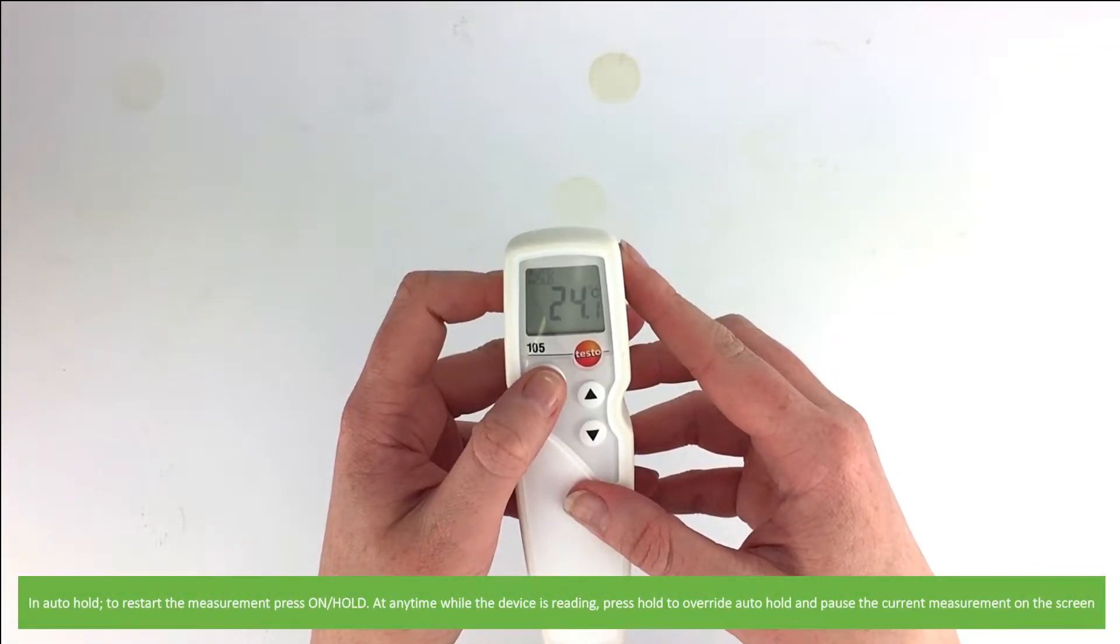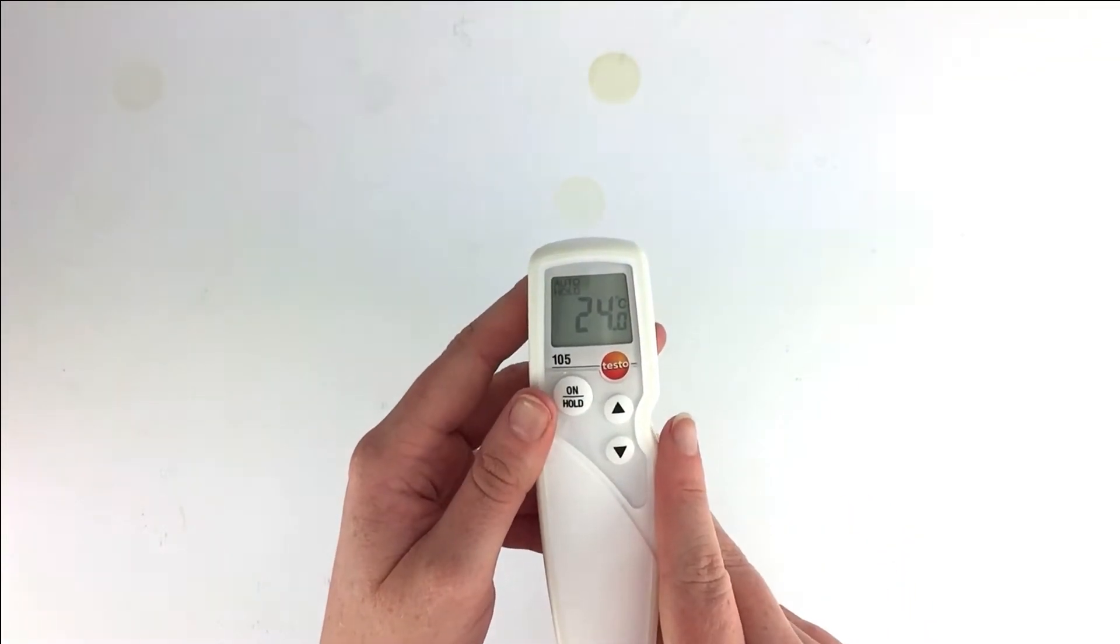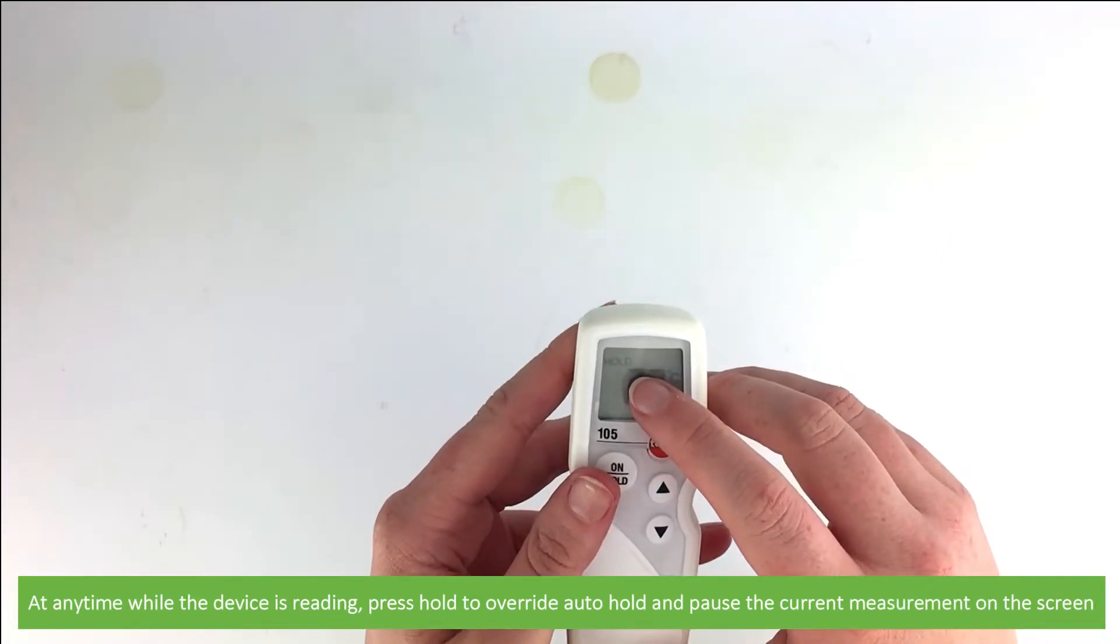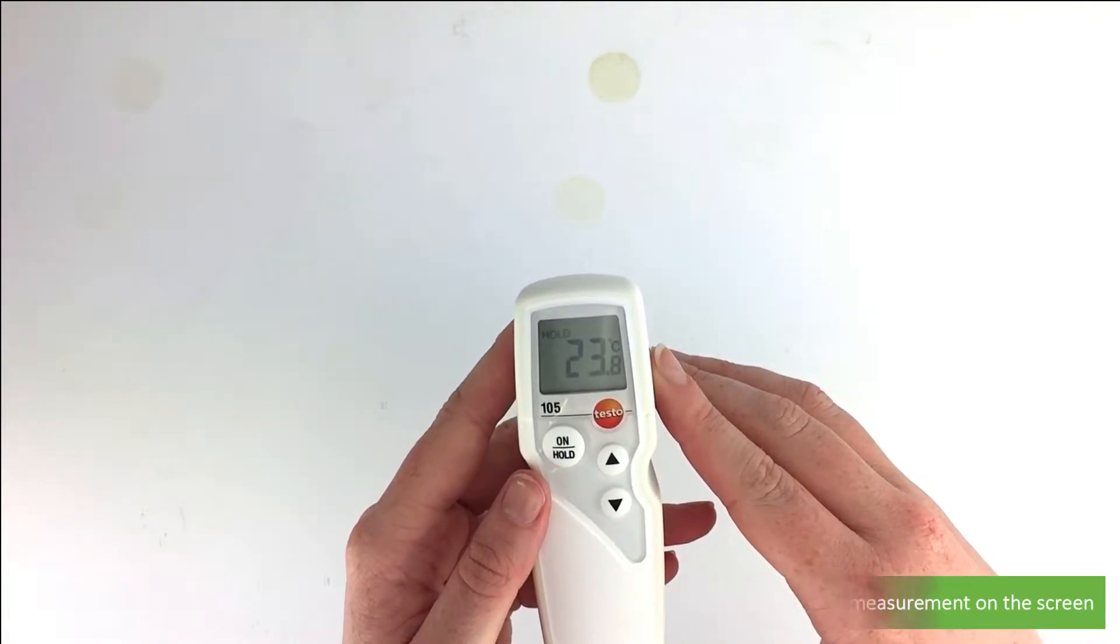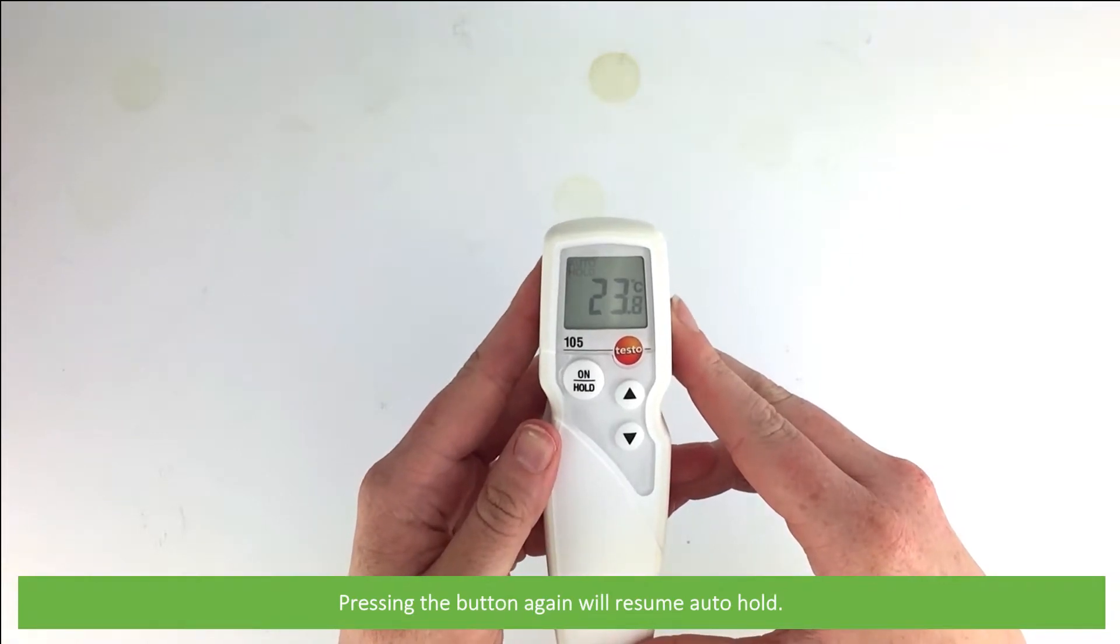In auto hold, to restart the measurement, press on hold. At any time while the device is reading, press hold to override auto hold and pause the current measurement on the screen. Pressing the button again will resume auto hold.